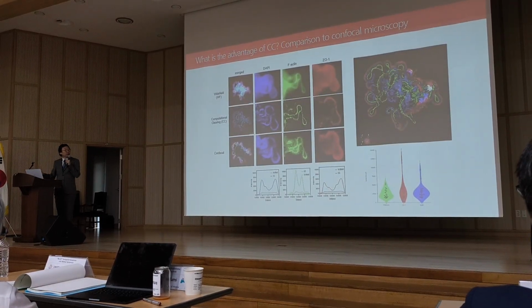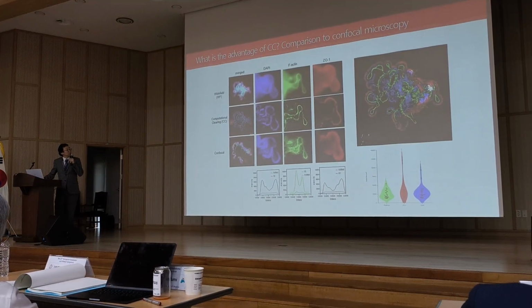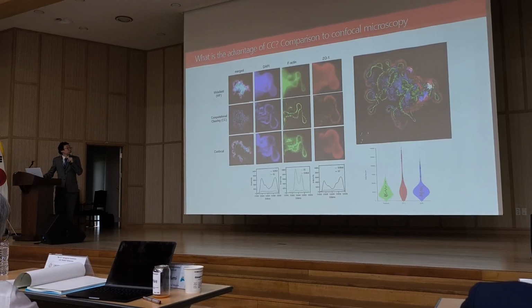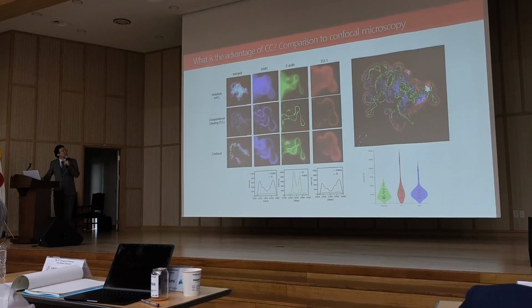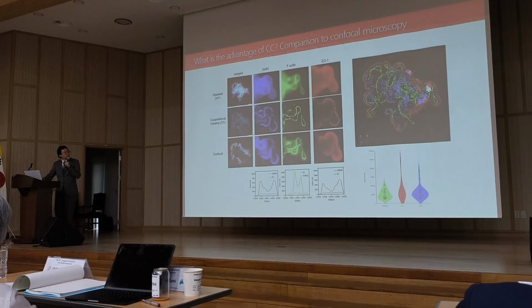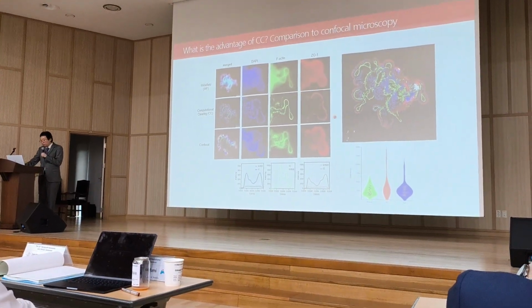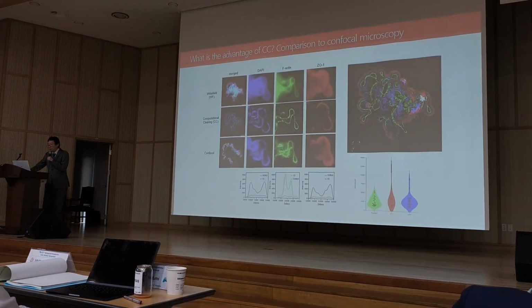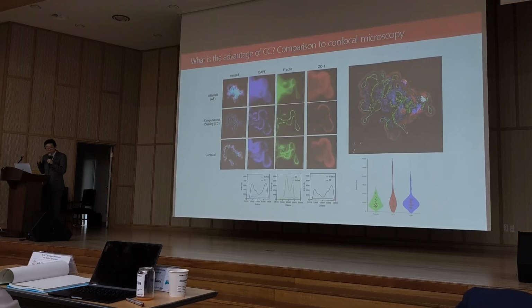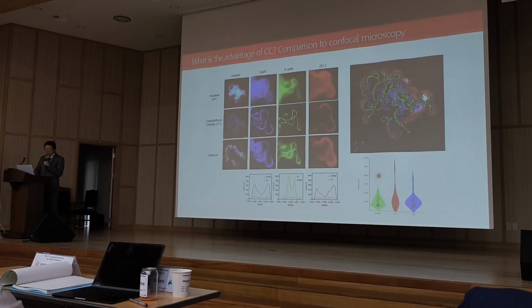And finally, we need to check the comparison with confocal microscopy images. Confocal microscopy is good, and so is our computational clearing based on wide field images. We tested DAPI, F-actin, and ZO1 staining. ZO1 is a marker of the tight junction. Using this CC method, we clearly identify ZO1 expression and tight junction formation, and with further analysis, image segmentation and mesh generation, we could extract physical parameters like volume and surface area.